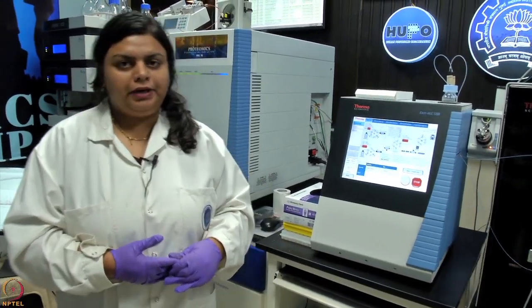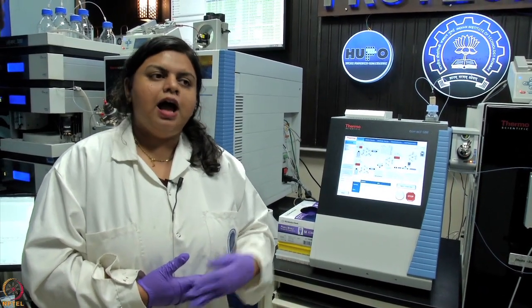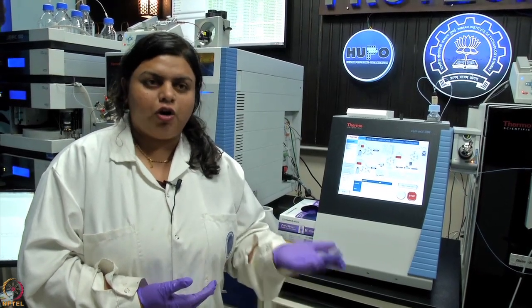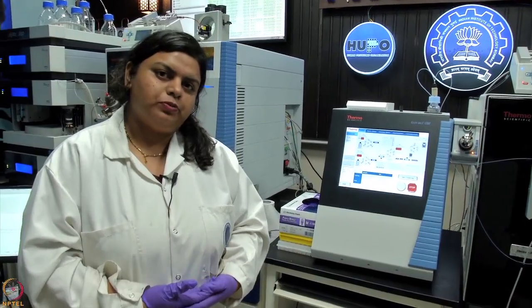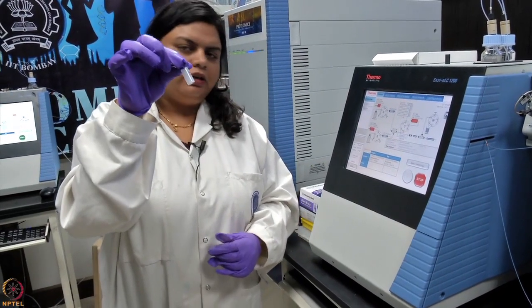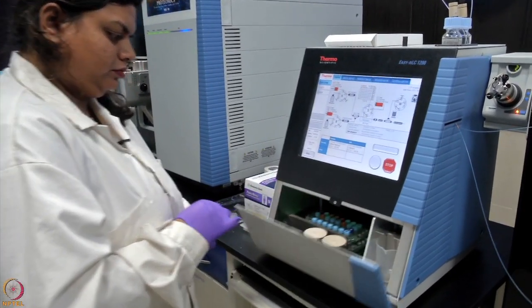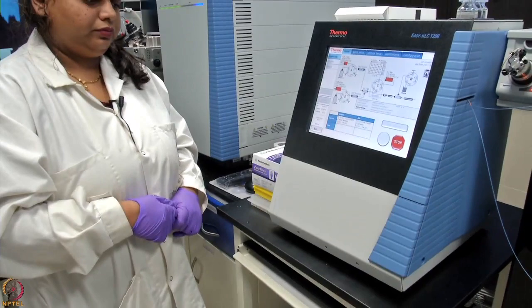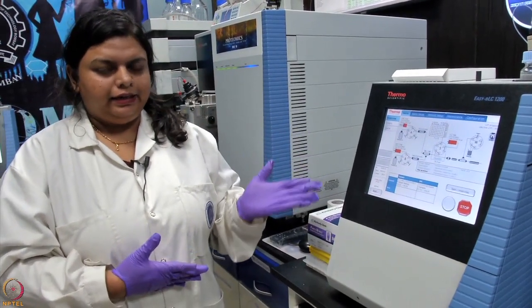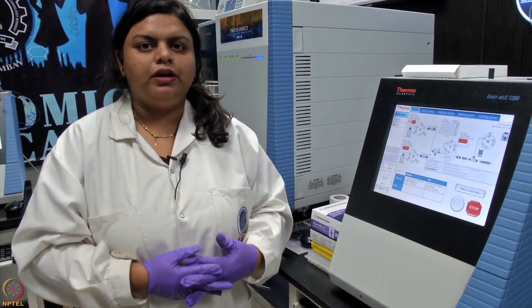As you saw, I already briefed you about the experimental workflow of IPMS, that is how we perform the immunoprecipitation using the antibody. After the process is done, we also saw that we can perform in-gel digestion as well as an in-solution digestion of the precipitated complex. Now when that is done, we have to submit the samples for mass spectrometry analysis. So now we'll be injecting our sample in the mass spectrometer. The sample will be run using the LC gradients and the mass spectrometer, and we will possibly be able to identify the interacting partners of our protein of interest against which the antibody was used.